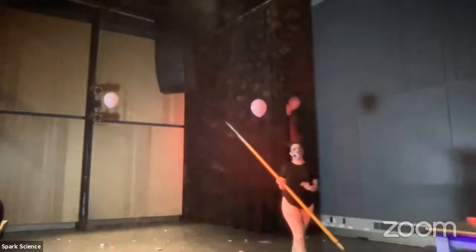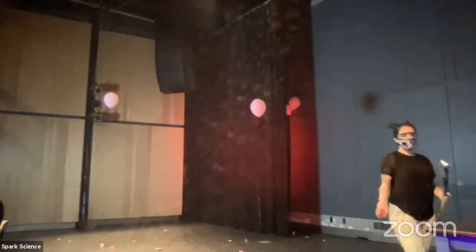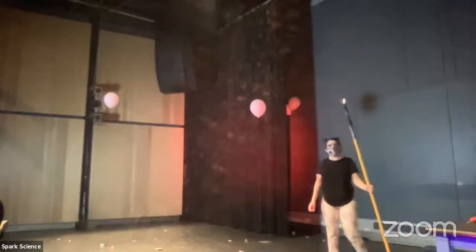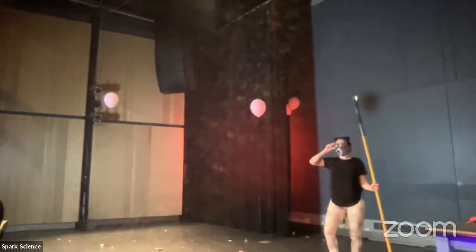Woohoo! Was that hydrogen or helium, Mel? That was helium. You're right, that was helium. Helium is the gas that we use in our birthday balloons because it is a noble gas and it does not react with anything. But we do have hydrogen gas, a very combustible, flammable gas.